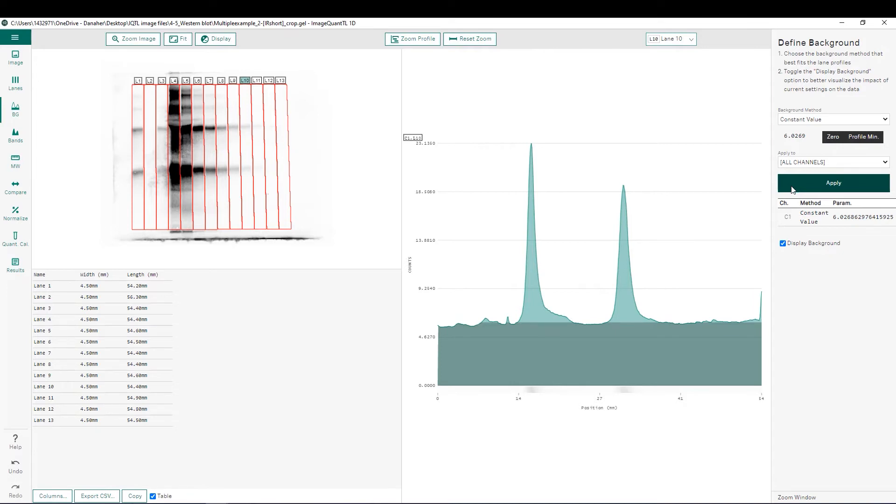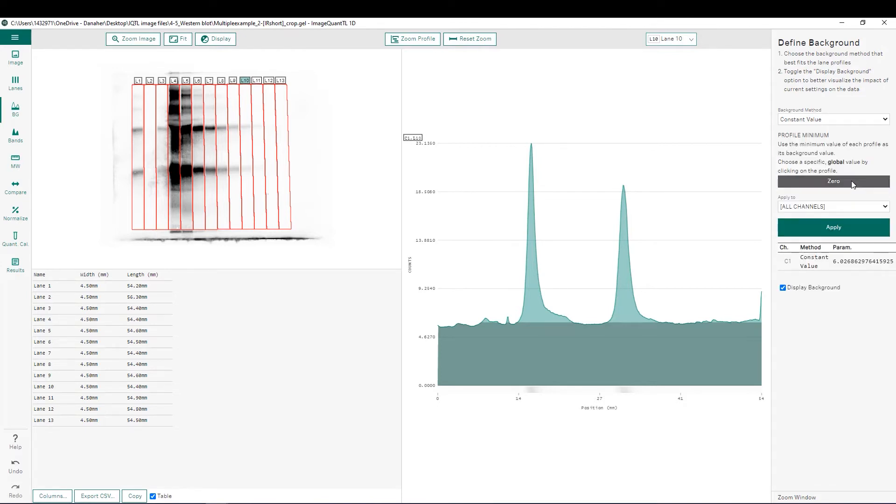To treat it as a localized background subtraction for each individual lane, you can simply choose profile minimum, which will use the lowest pixel intensity within that individual lane and apply that, so every lane is going to have its own individual background subtraction level.